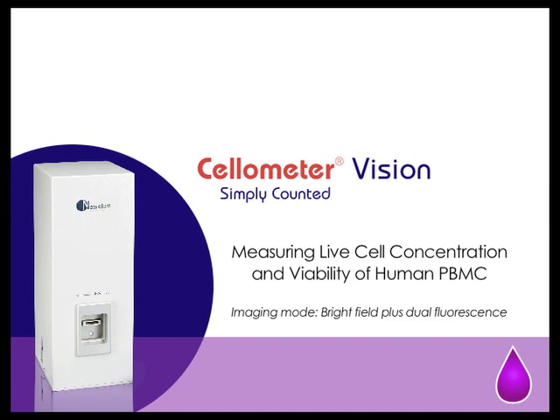Measuring live cell concentration and viability of human PBMC using Cellometer Vision. The imaging mode is bright field plus dual fluorescence.